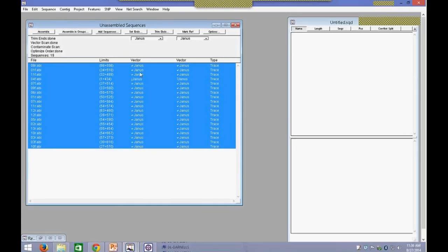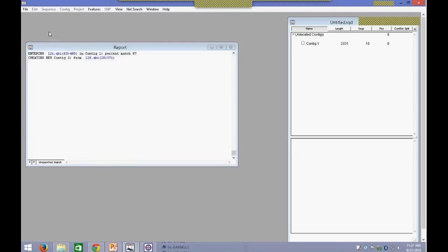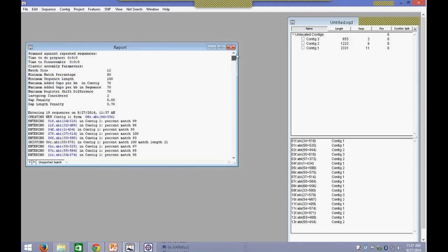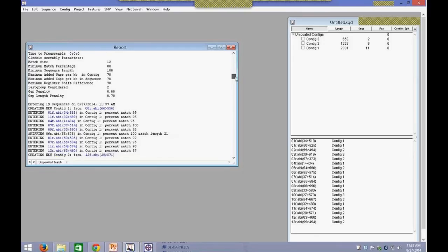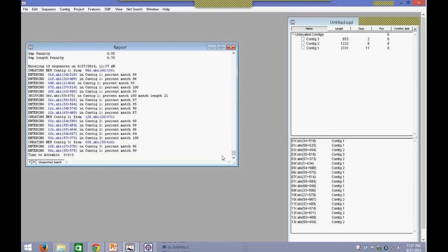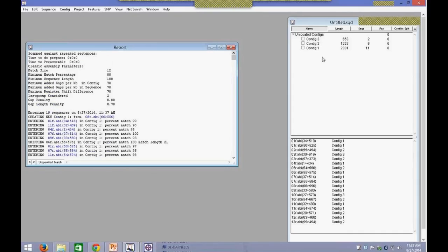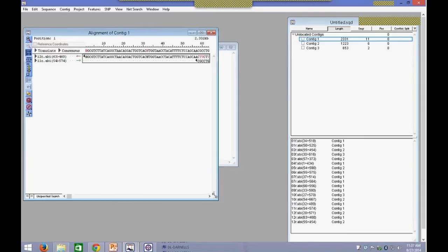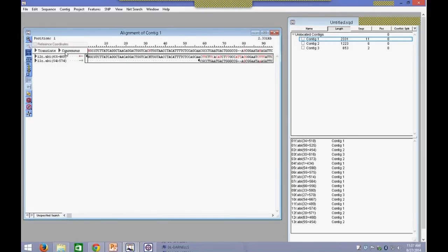Now we have scanned our vector and we're ready to assemble. To begin your assembly, all you have to do is click on Assemble. Once assembled, we will get the report again, giving a summary of our assembly, the total time it took, and the reads that went into the project. We will sort again based on length in the Contig window and then open the Contig. Here, we can see that we have a true consensus.